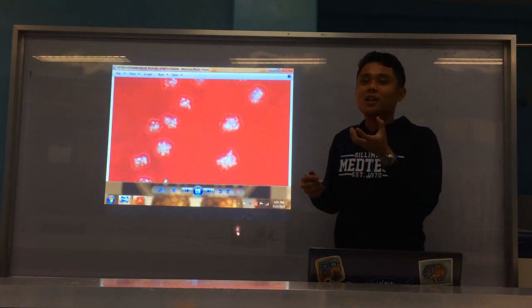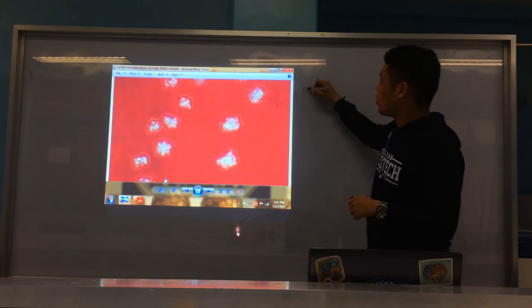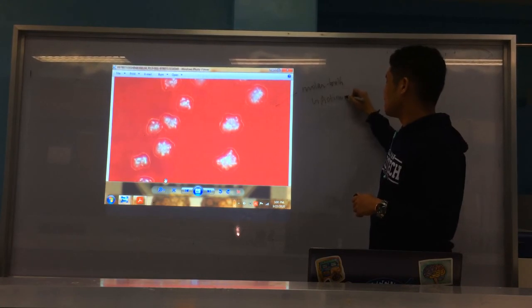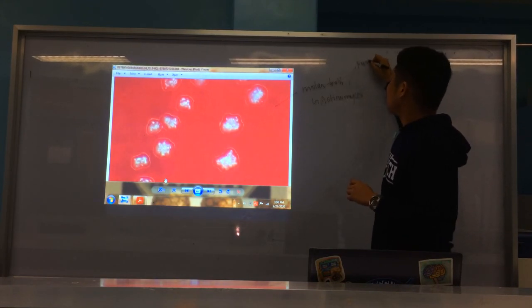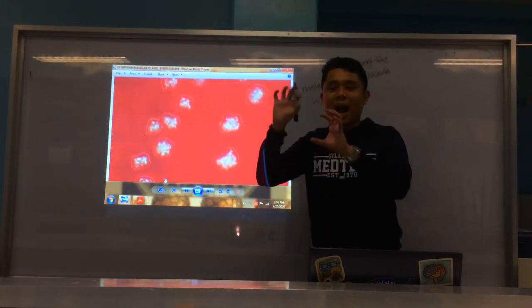Meaning, mura siyag molar tooth, mura siyag tango. Okay? All right. So, molar tooth colonies, characteristic ni siya of actinomyces. Okay? Actinomyces. Okay? Same silang family sa nocardia. It's a fungi-like bacteria. Okay? So, meaning, dili dyan siya fungi, mura ra siyag fungi. Okay? Pero bacteria gid siya. Because under gram staining or under microscopy, marag na siya mga hyphae.